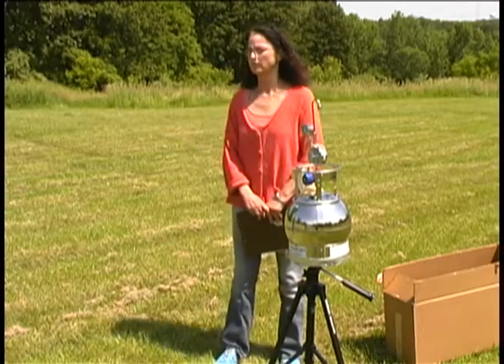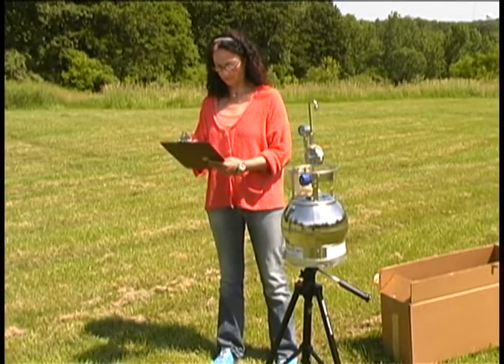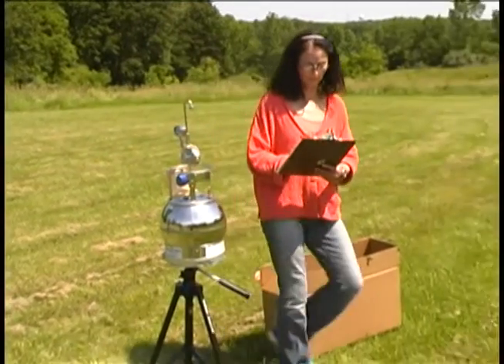While waiting, take caution not to bump the tripod legs. Stand about six feet downwind from the canister. Complete the field log.